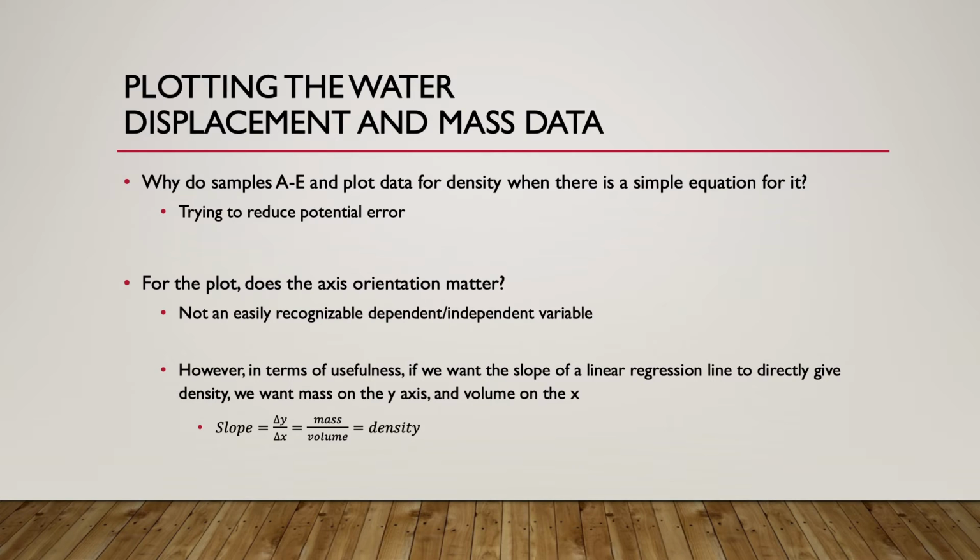And so that's how we're going to go about trying to calculate density for different solids here in lab. You will be making a couple plots to calculate those densities. And again, the reason we're making these plots and using the slope of these lines is that by taking multiple data points into account, it's hopefully minimizing the error if we had one bad measurement, so that it's not going to mess up our density determination all that much.